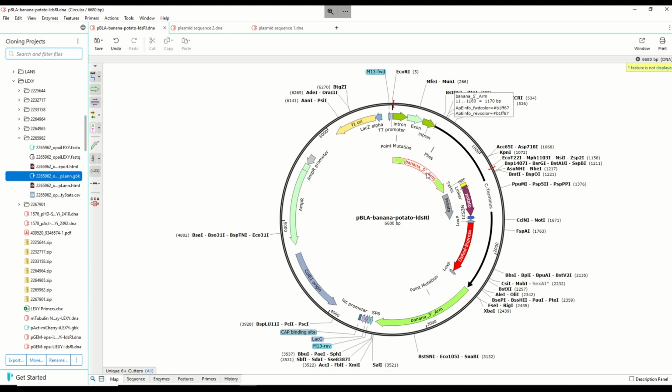So today we're going to do sequence alignments using 3 different methods. We'll start with the most advanced, expensive one, which is through SnapGene, which is very handy and nice if you can afford it.